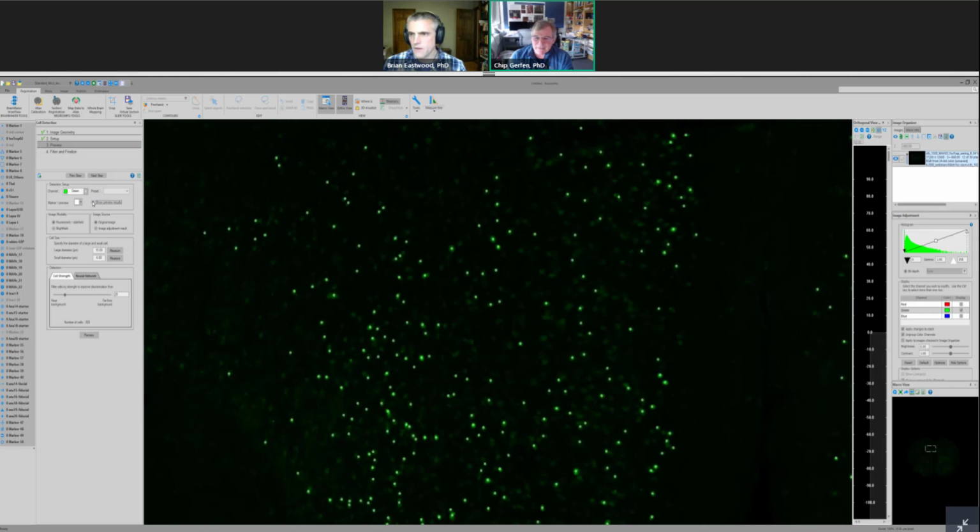So this is one of the problems with c-fos labeling: with cells like the rabies labeled cells and a lot of other types of cells, they're either labeled or they're not labeled. c-fos gives a labeling that is definitely a range. So there are neurons that are more active than not. That's one of the issues that we'll be talking about a little bit in terms of using these parameters. We can adjust the parameters and see more cells labeled. So it's challenging because of that. Okay, so the cell strength algorithm does a pretty good job. It does a very good job. However, we have created a neural network.